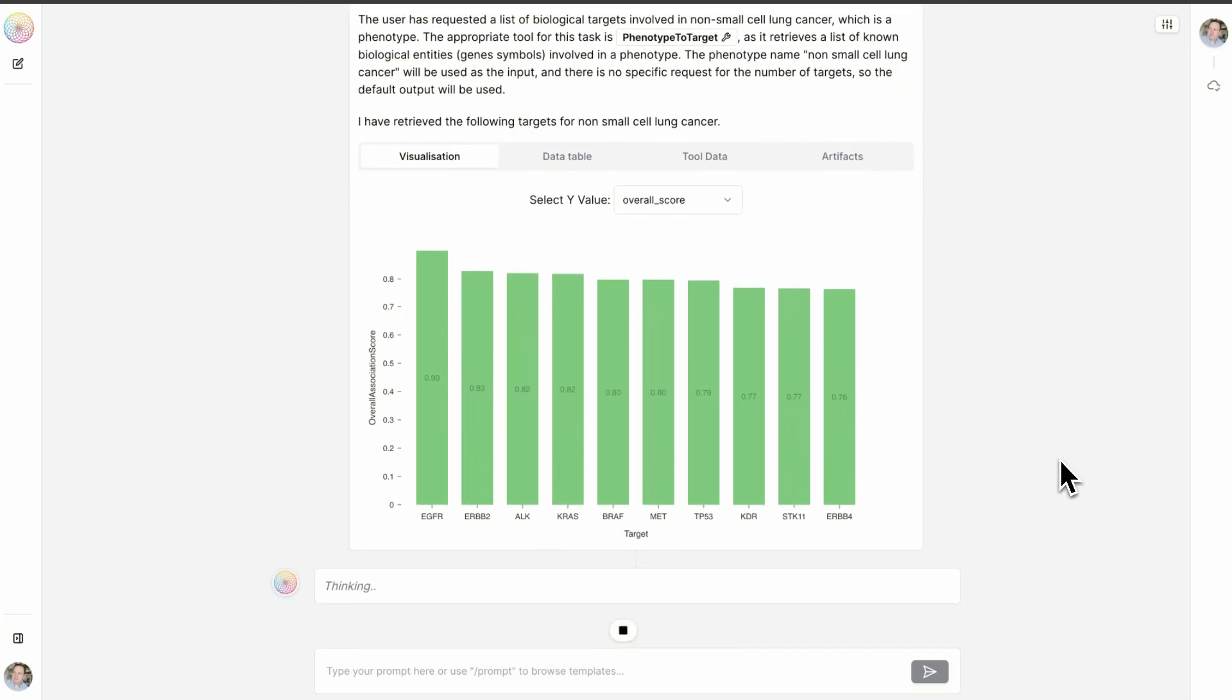We can see many genes here commonly associated with lung cancer, including EGFR, ALK, KRAS, BRAF, et cetera.